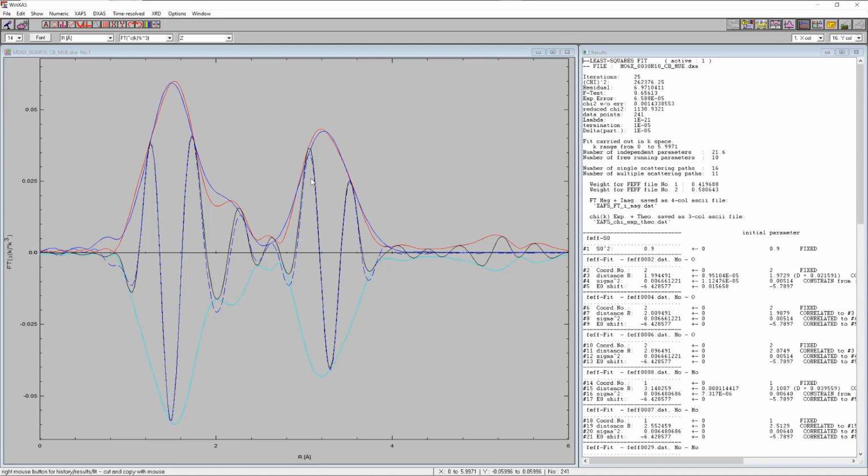So this is how this multiple phases EXAFS procedure works when you combine the XANES analysis with the EXAFS analysis, when you combine the XANES fit to obtain those phase concentrations with the XAFS refinement, where you use those phases then to refine a sum of those two to the experimental spectrum. So now we have the macro, we have tested the macro, and it seems to be working okay, and now we can apply this macro to the entire series of spectra.